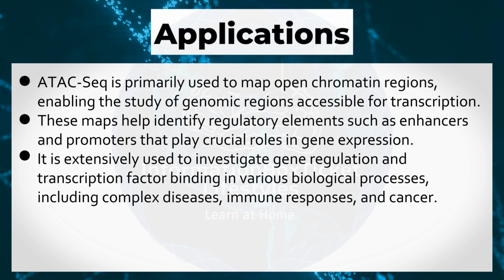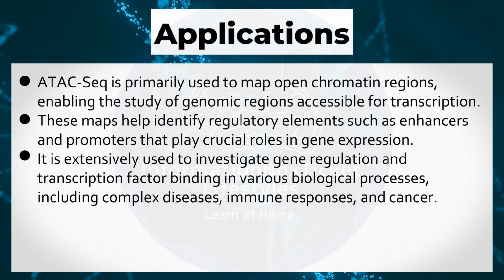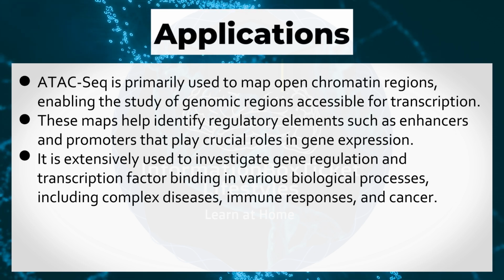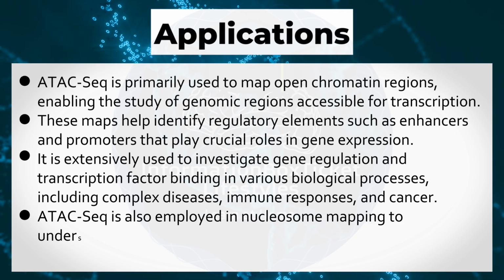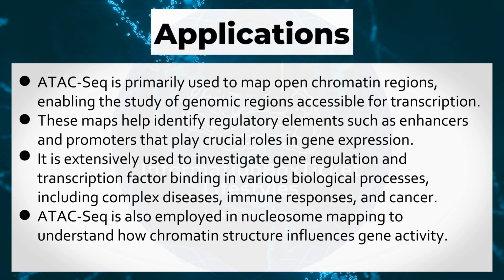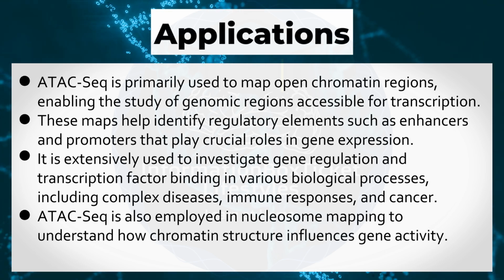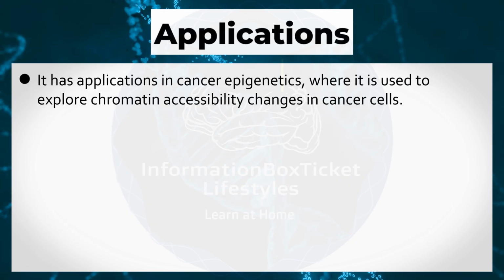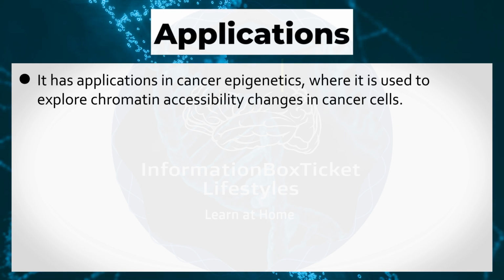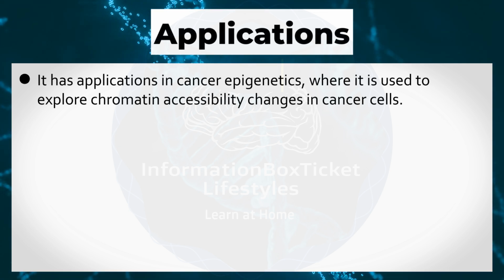It is extensively used to investigate gene regulation and transcription factor binding in various biological processes, including complex diseases, immune responses, and cancer. ATAC-Seq is also employed in nucleosome mapping to understand how chromatin structure influences gene activity. It has applications in cancer epigenetics, where it is used to explore chromatin accessibility changes in cancer cells.